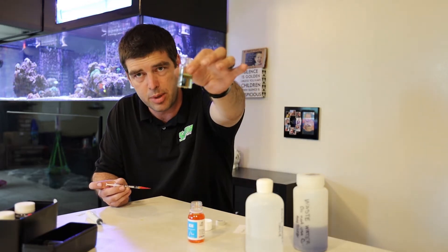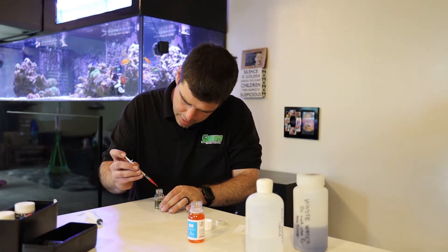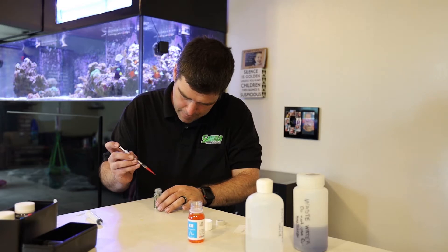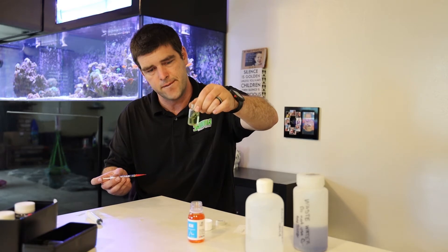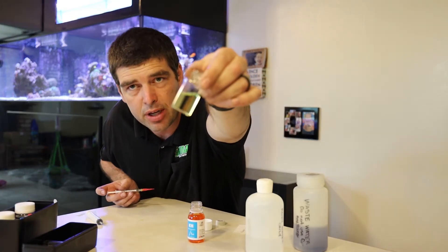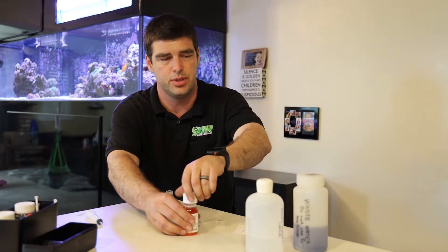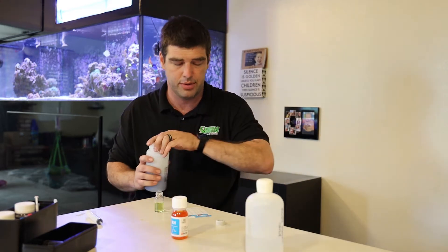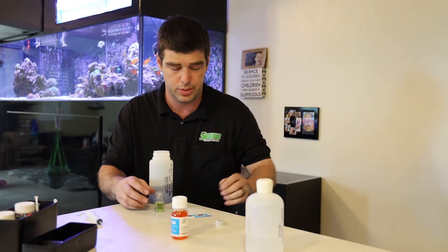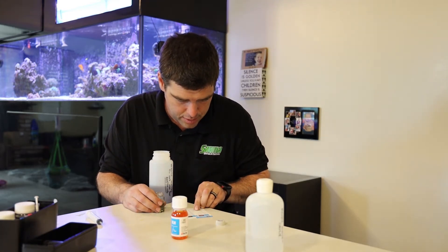So right now it's still pretty much green — add one more drop. And now it's yellow, so this means I've gone too far. So that last measurement I had, which was 0.2, is correct. If you look at the other side, they did not do the math for you, so you have to know 1 minus 0.2 equals 0.8. So that equals a dKH of 11.2.